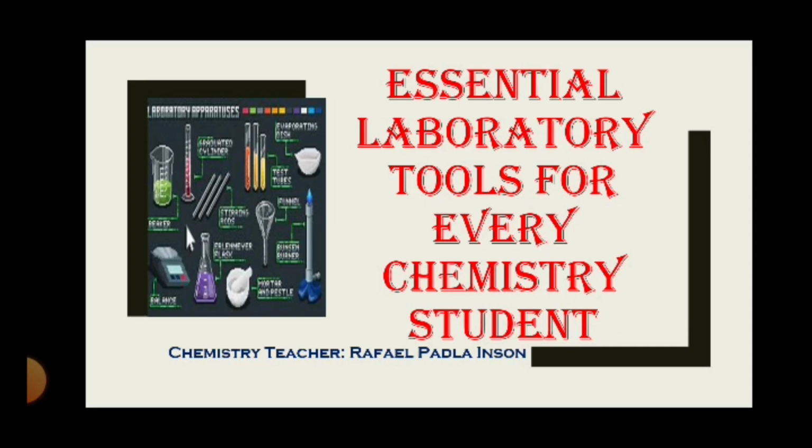So take the time to familiarize yourself with these specialized instruments, understand their functionalities, and learn the proper techniques for their usage. These preparatory steps are essential to ensure a smooth and successful laboratory experience, where you can confidently utilize these tools with precision and confidence.